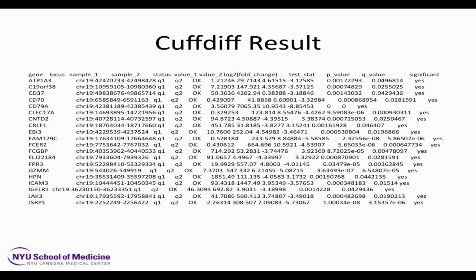If one gene has several copies, how to identify the expression level of each copy? You mean the multi-gene family, basically? Yeah. Well, TopHat does its best to identify which gene each transcript comes from.